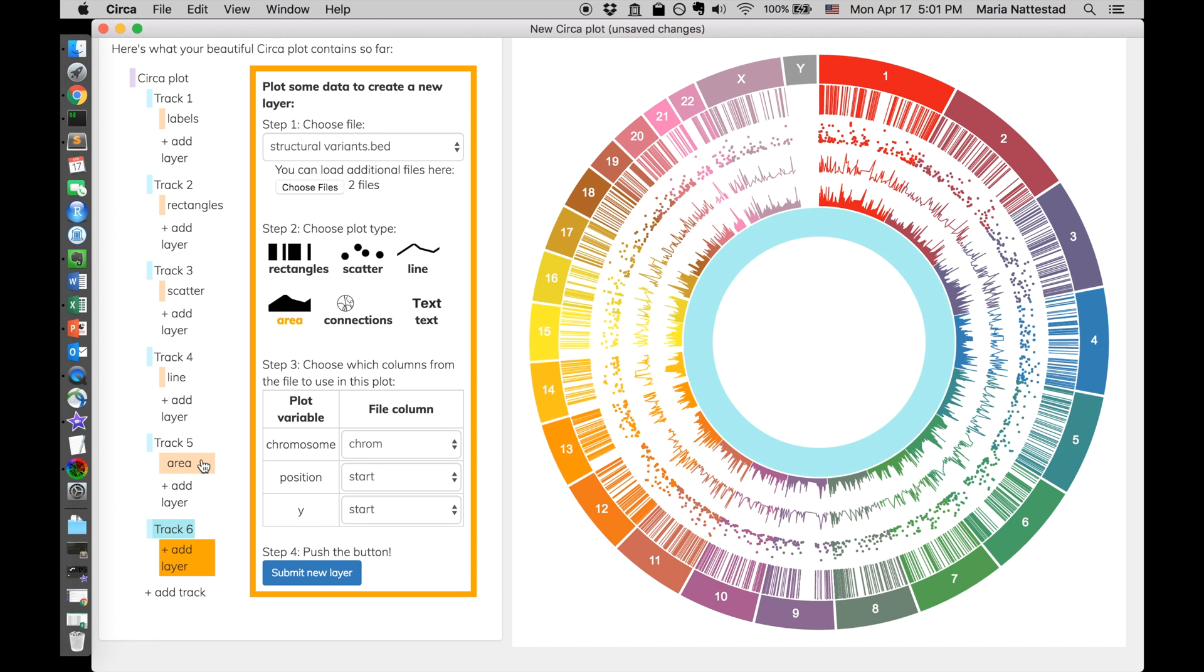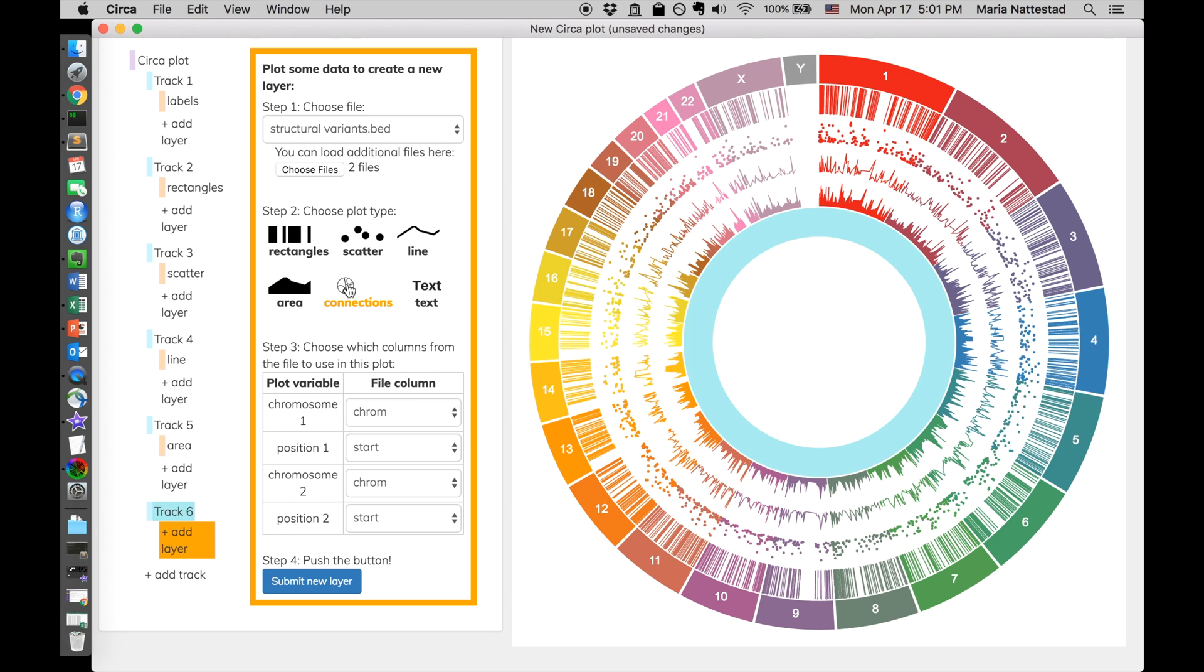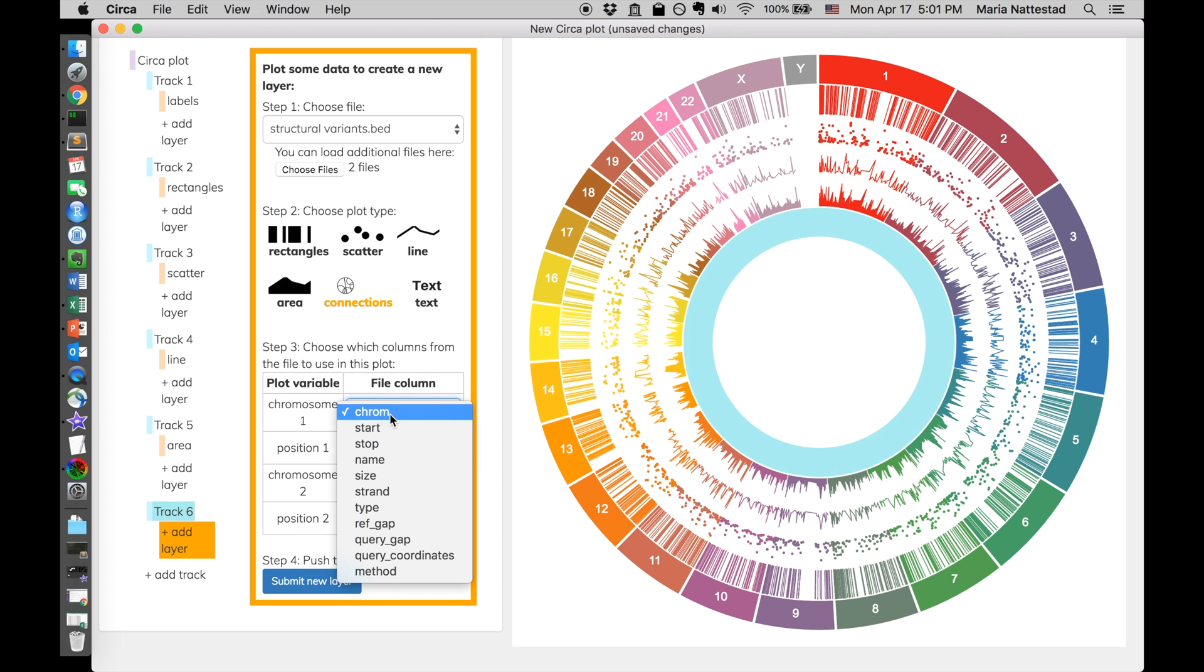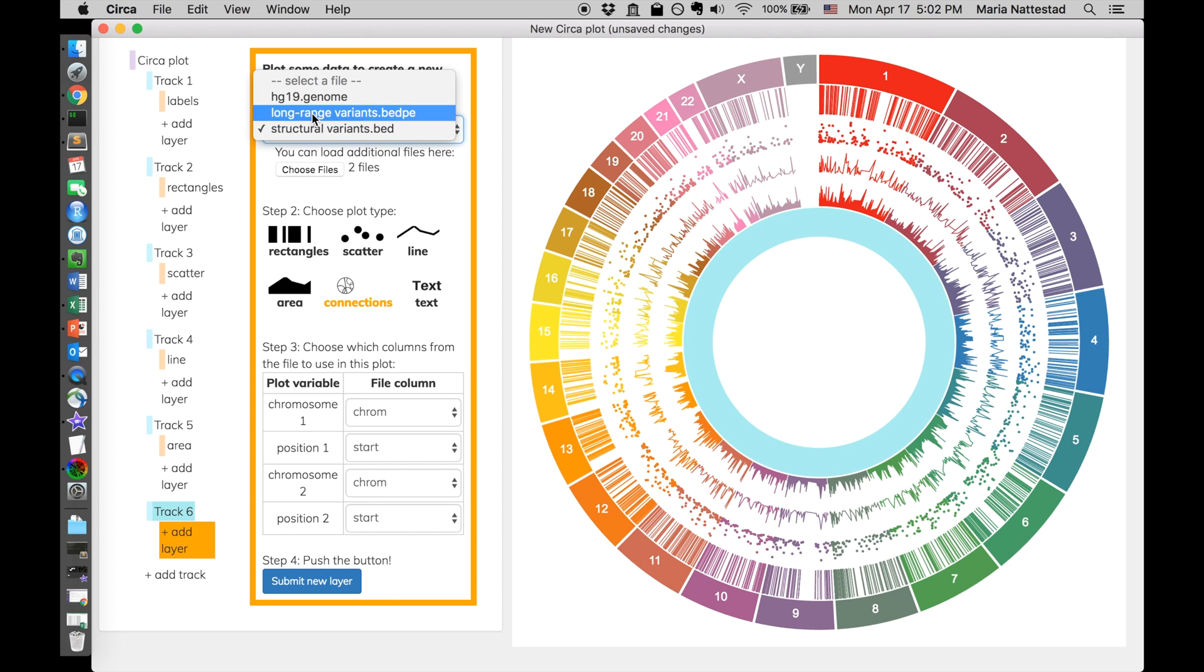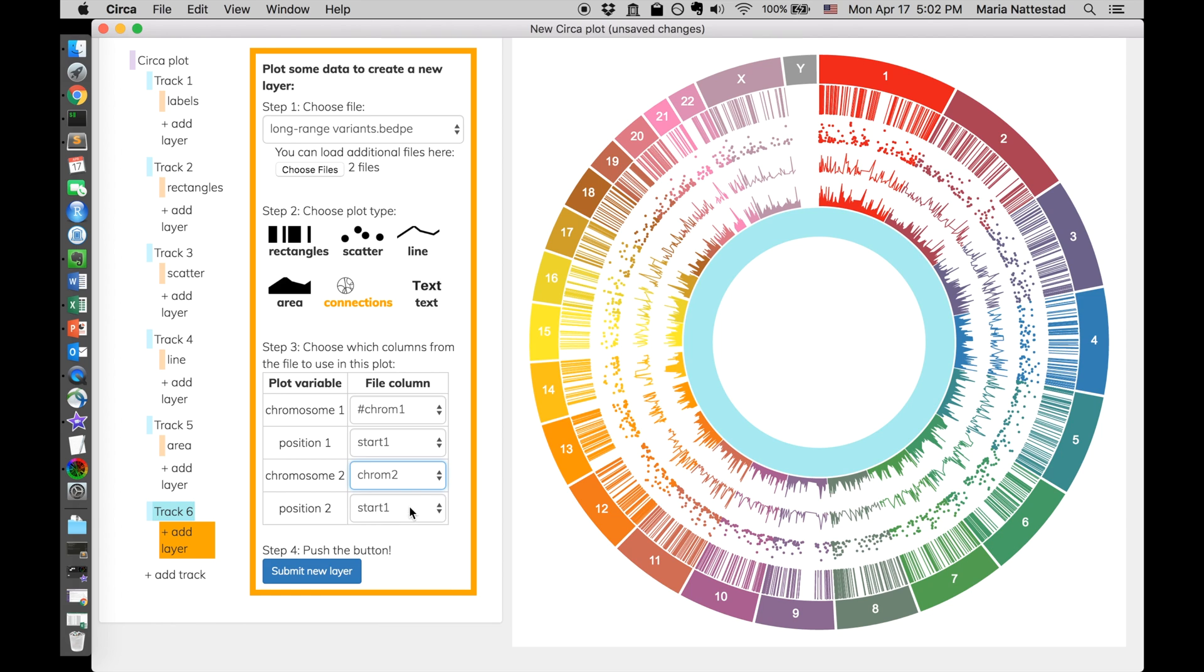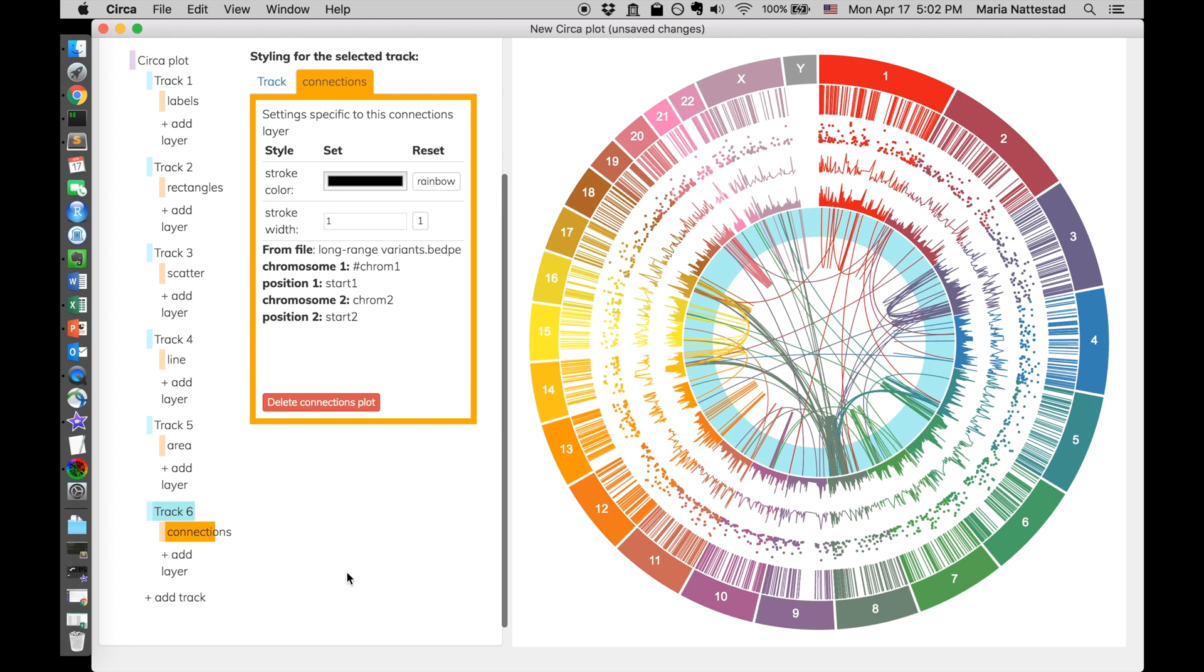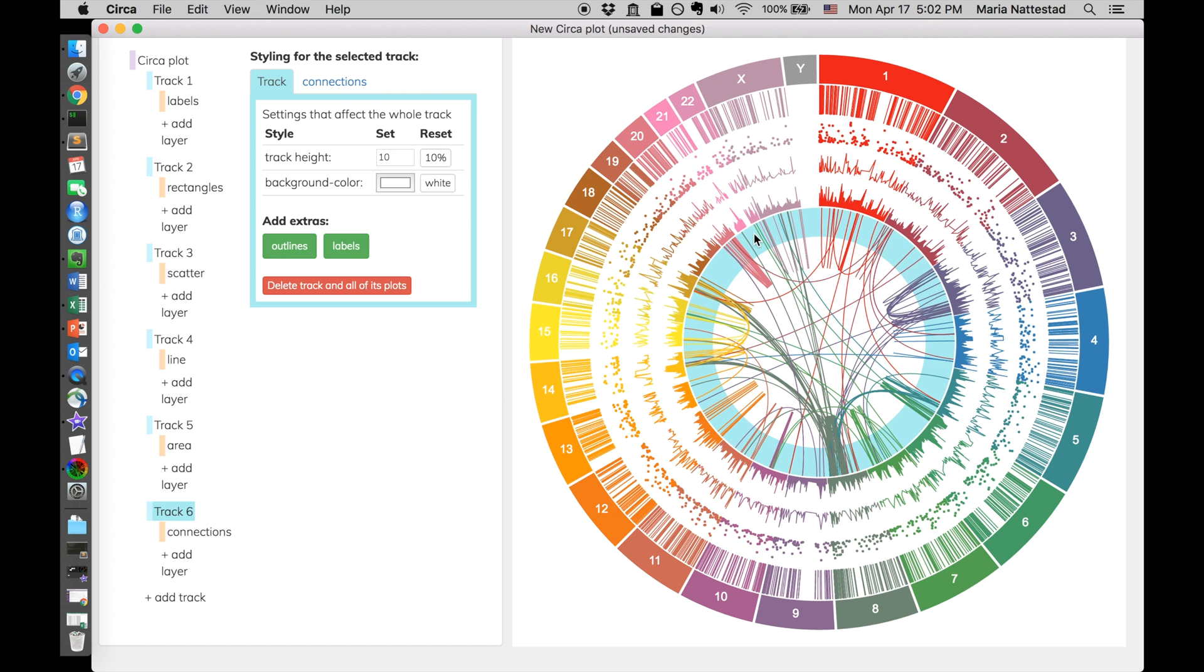Now in addition to area, the next one is connections. For this one, I'm going to need the bed.pe file. Because this file only has one chromosome, so I wouldn't know what to pick for chromosome two. So I'm going to switch it to the long range variants bed.pe file that I have. And this one has chromosome two, and then start two. So that's the start location of the second breakpoint from that variant. And we're going to push that. Very nice.